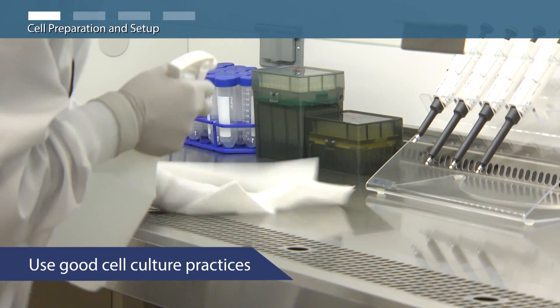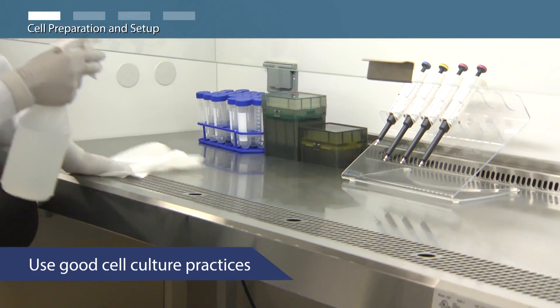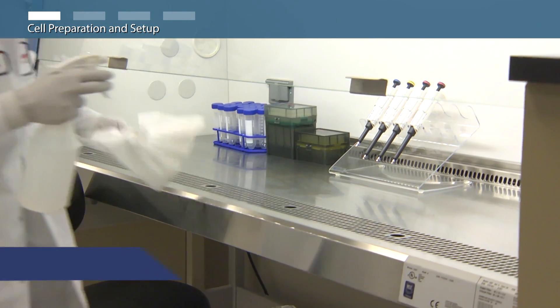Be sure to clean your cell culture hood and work surface by spraying and wiping them down with 70% ethanol.